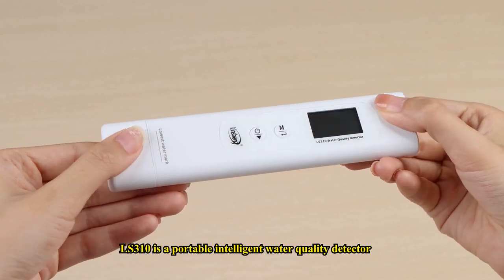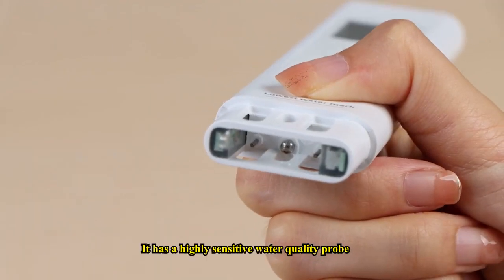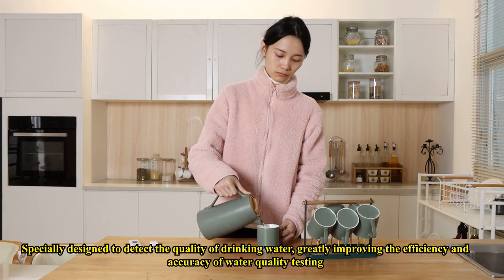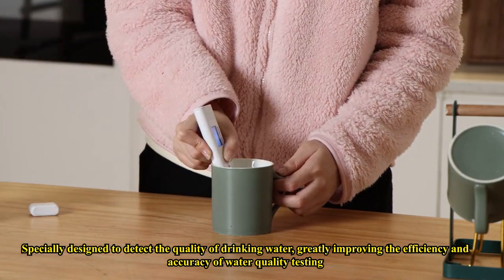LS310 is a portable intelligent water quality detector. It has a highly sensitive water quality probe, specially designed to detect the quality of drinking water, greatly improving the efficiency and accuracy of water quality testing.